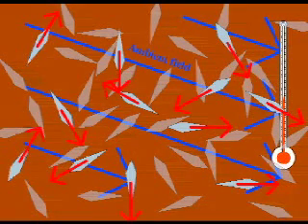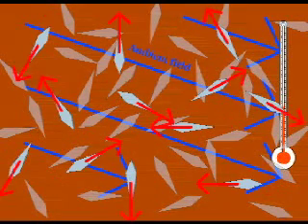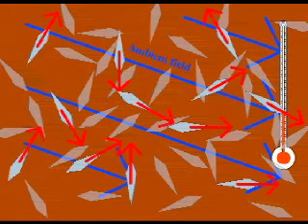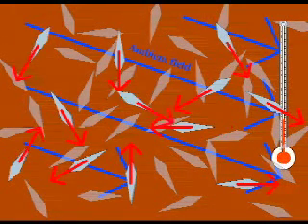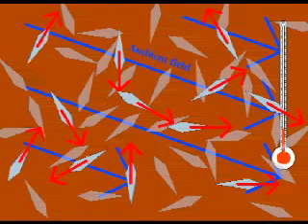The stronger the field, the stronger the tendency for a crystal's magnetization to be aligned with it, so the strength of the sample's permanent magnetization will be proportional to the strength of the field when it formed. Agnès is using samples from potsherds, which moved around after they formed and so don't keep a record of the ancient field's direction, but they can still be used to find the old field's intensity.